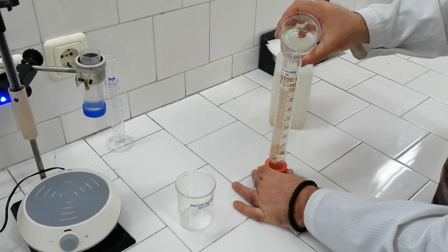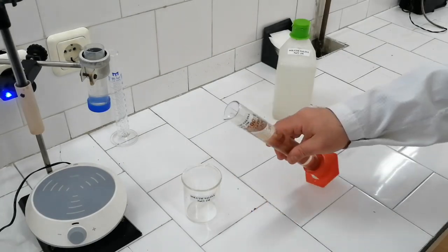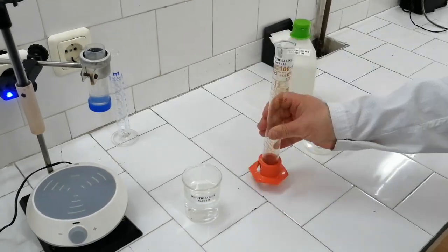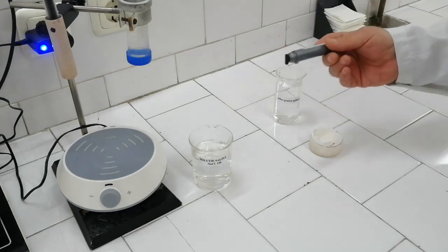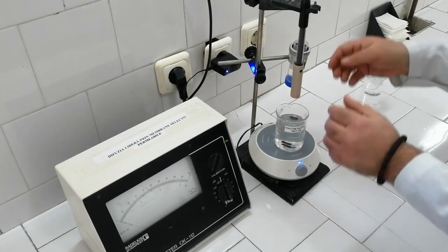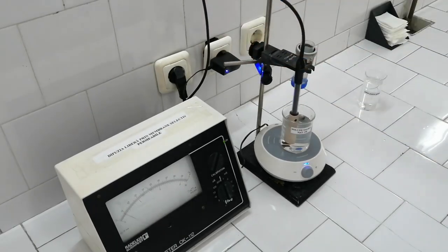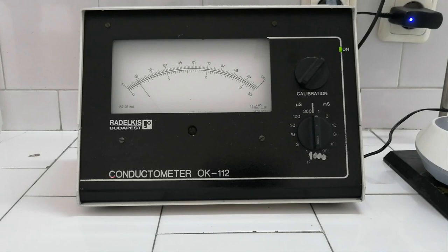Using the other graded cylinder, fill the measuring Berzelius glass with 120 ml of saline solution. Add the magnet inside and place the glass on the magnetic stirrer. Turn on the stirring and dip the electrode into the saline solution. Follow these steps to measure the electrical conductance of this solution.